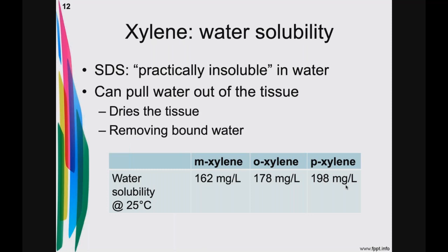I had talked to you about how xylene does have a water solubility. When you take a look at your safety data sheet, under water solubility it says practically insoluble. It does not say zero because xylene can hold a very small degree of water. It's the same thing as if you take alcohol and you put a little bit of water into it: the water gets absorbed between the alcohol molecules. It doesn't float. The same thing with xylene.